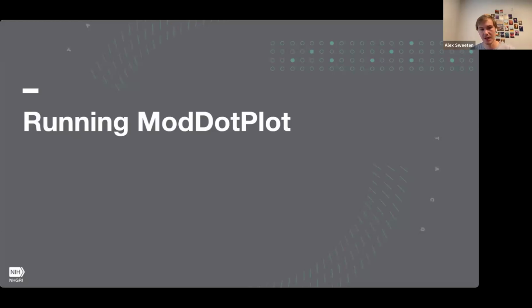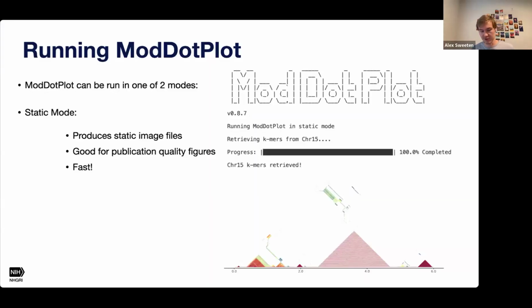All right, so hopefully I've given you some confidence in how to interpret a dot plot. So now we'll go more to the interactive session of this tutorial, which is running ModDotPlot. Essentially, ModDotPlot can be run in one of two modes. The first is static mode.